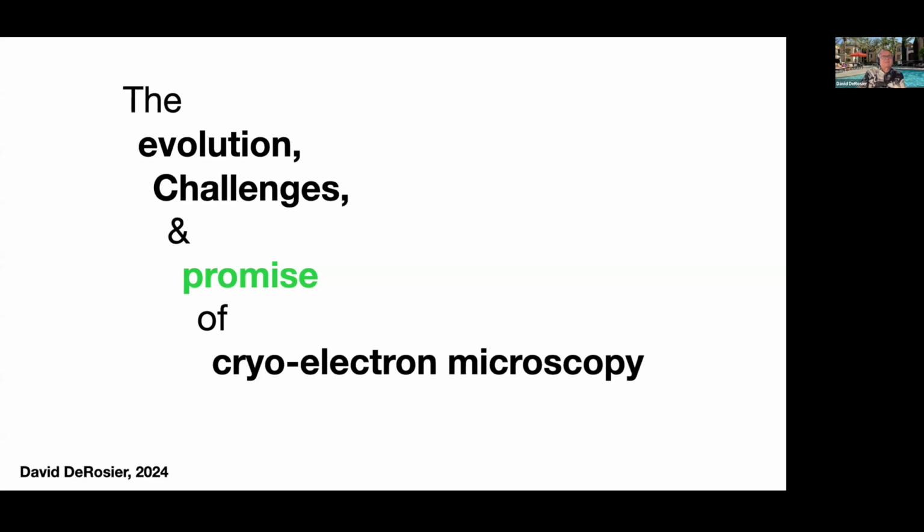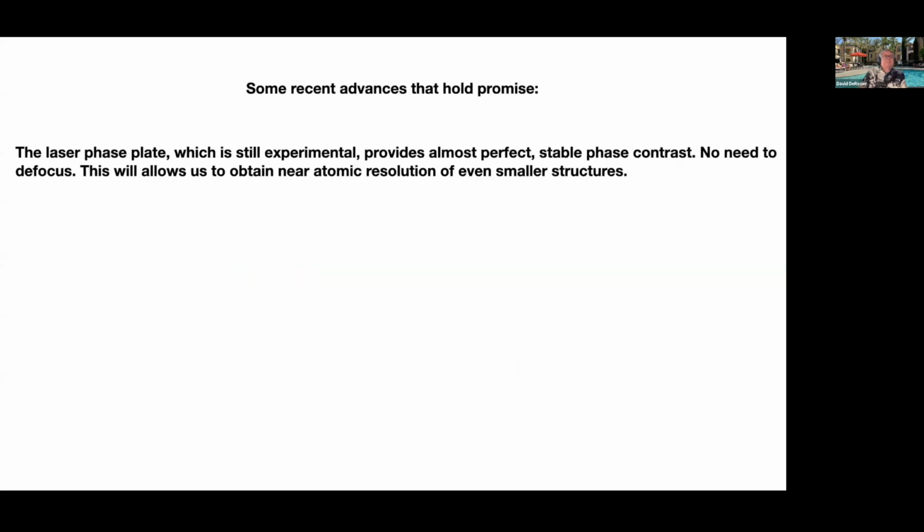So I want to talk finally about the promise, and I don't want to talk about all the aspects of it. I just want to mention a few. Now, the laser phase plate, which is still in the experimental stages, provides almost perfect stable phase contrast. So there's no need to defocus. And this will allow us to obtain near atomic resolution of even smaller structures than the one mentioned by Lee Kuo.